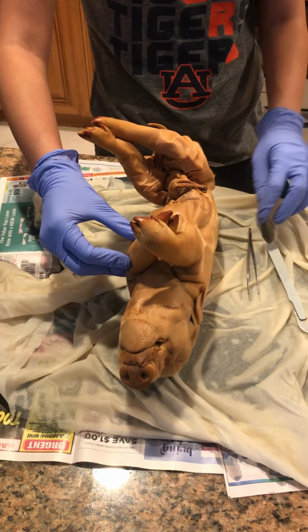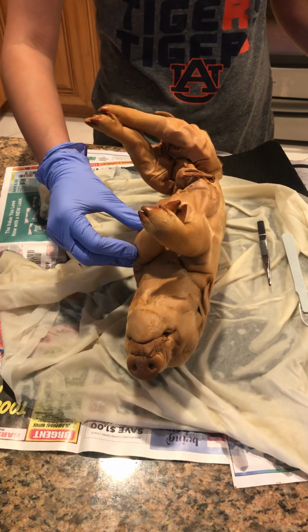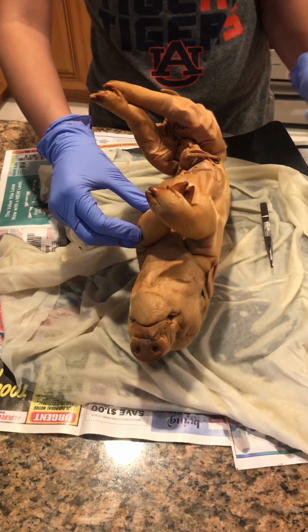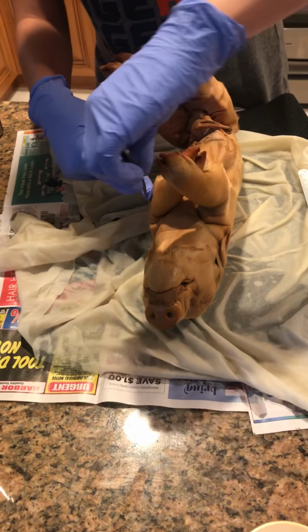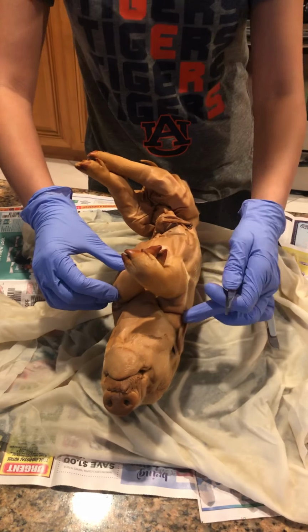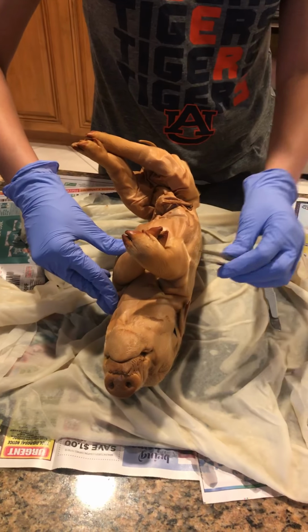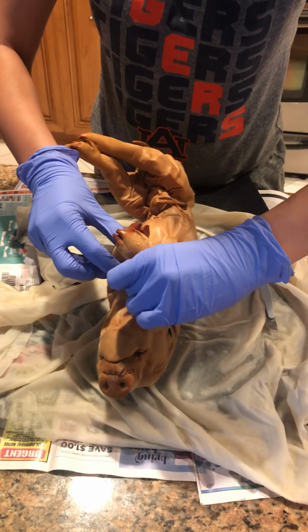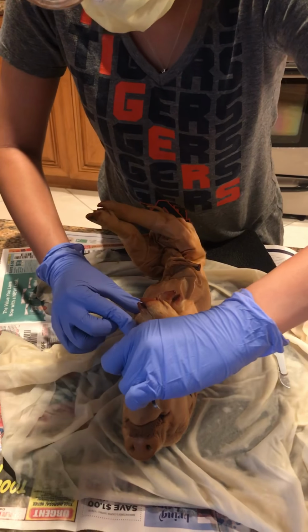Right after that, we have the brachiocephalic trunk. Brachiocephalic trunk is basically the artery that supplies the blood to the right arm and the head and the neck. So the pig's right arm is on this side, and it's this artery that goes in right here. So right here, and it goes up. So this little vein right here.